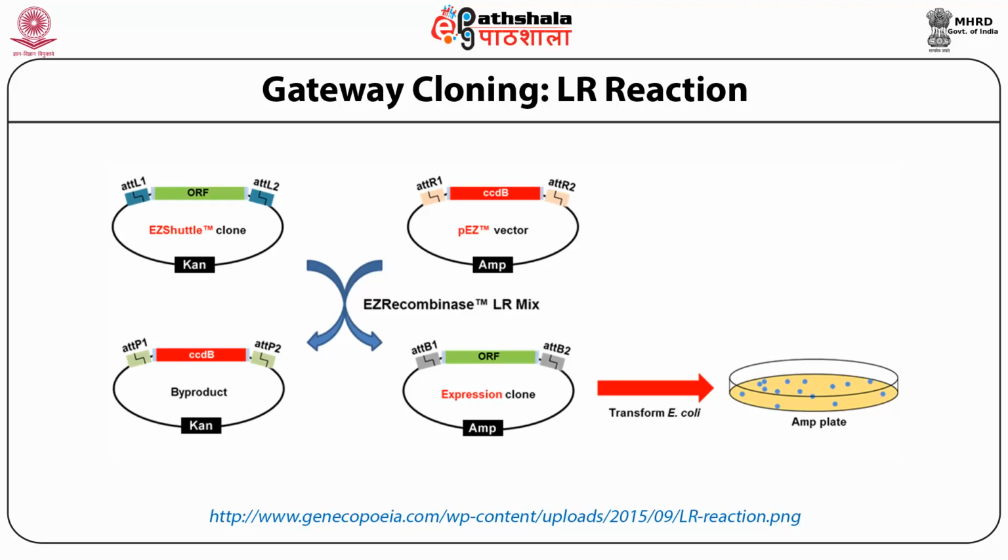Now when these two are mixed, due to integration or recombination, we see that our gene of interest has moved from the entry vector into the expression vector. But in this reaction, we also get a byproduct in which the gene which was present in between attR1 and attR2 of the destination vector is transferred into a byproduct vector, and now the sites are changed from attR1, attR2 to attP1 and attP2, while our expression vector will have our gene of interest with attB1 and attB2 sites.